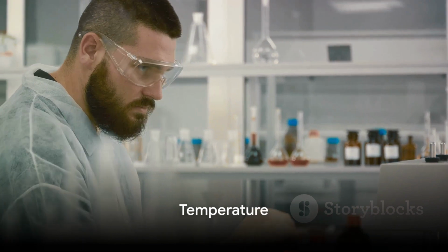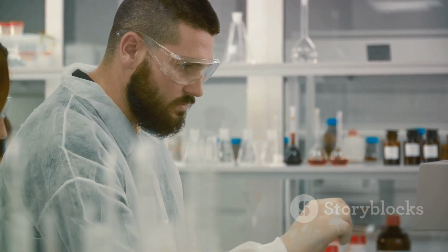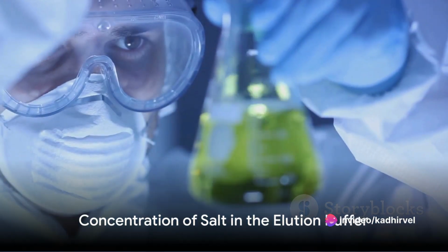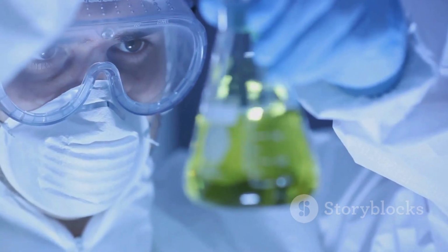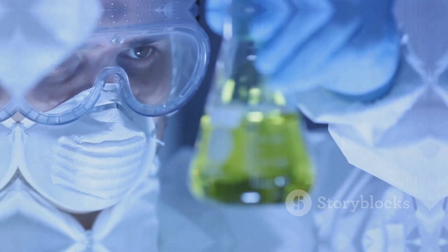Temperature, while seemingly simple, can influence the stability of the antibody and the resin, as well as the kinetics of the binding and elution processes. The concentration of salt in the elution buffer is another key player. It affects the strength of interaction between the antibody and the resin, influencing elution efficiency and purity.